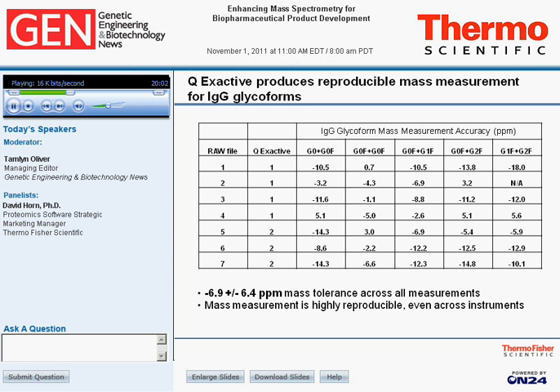And one interesting thing that we found was there was actually an average offset of minus 7 ppm. And I'll talk about that in a moment. But the spread, the standard deviation of the spread of mass accuracy errors, is 6.4 ppm. So we think that's a better indication of the mass tolerance of the system. The minus 7 ppm corresponds to roughly 1 Dalton.